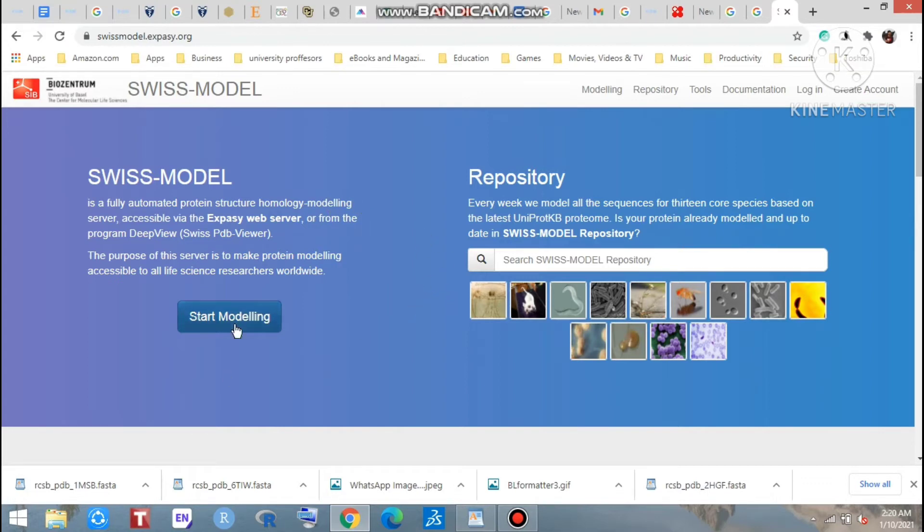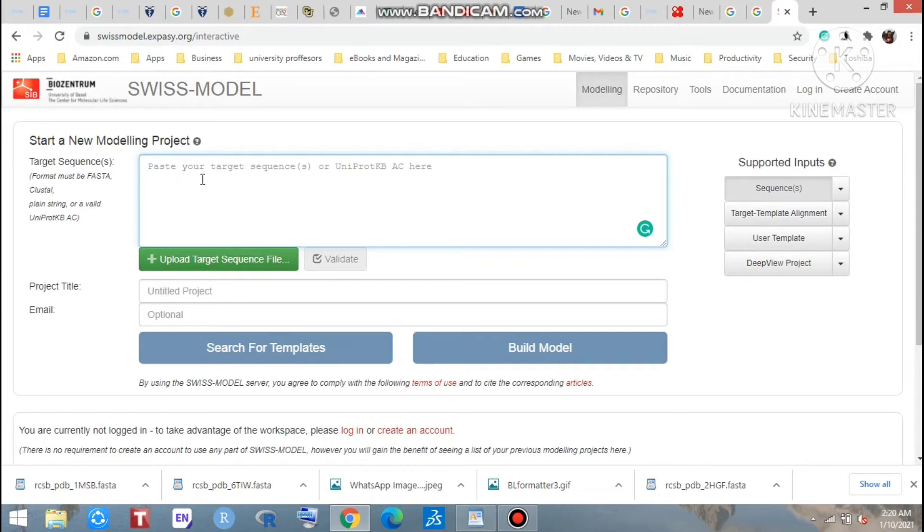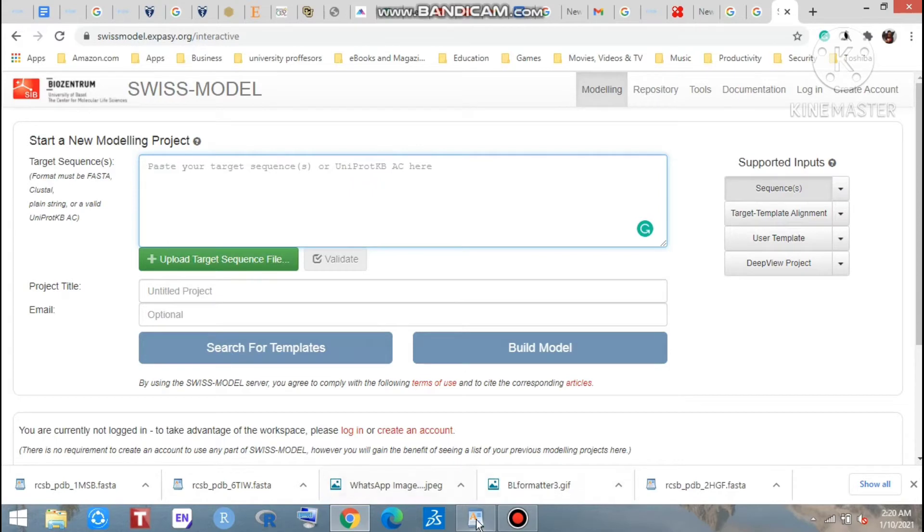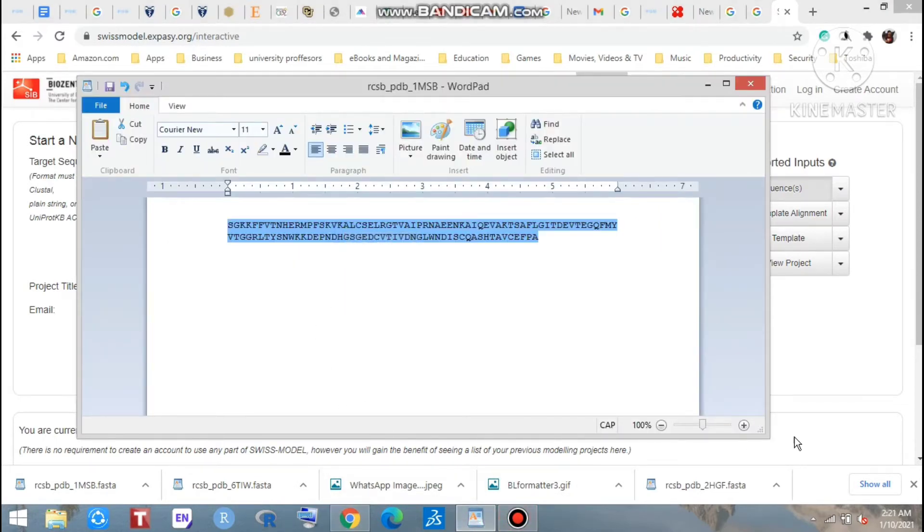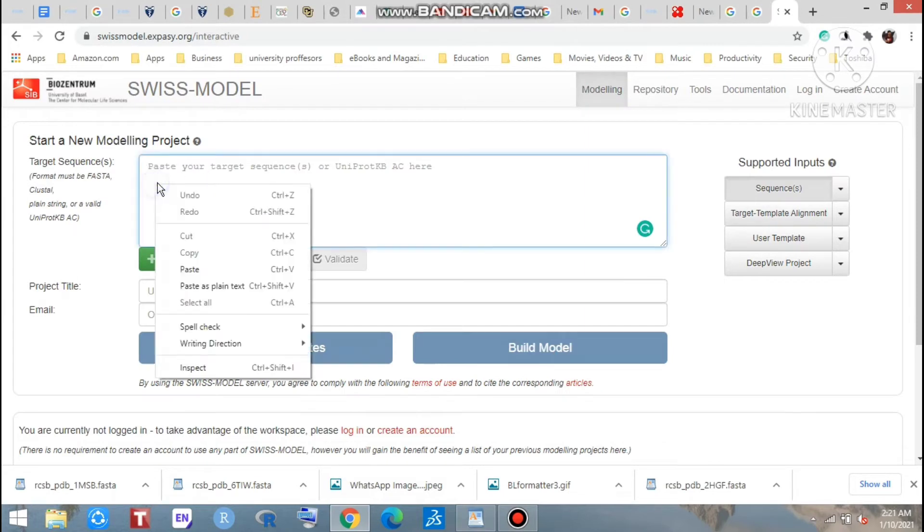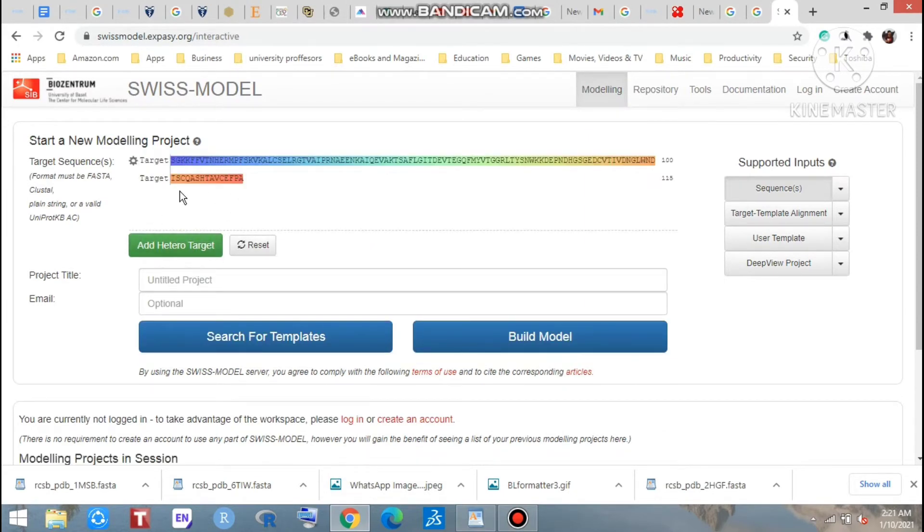Just go to start modeling. That is here - paste your target sequence. That means we have a target sequence and now we will copy this from here and we paste that here. Look at that, that is a sequence which is showing here as a colorful sequence.